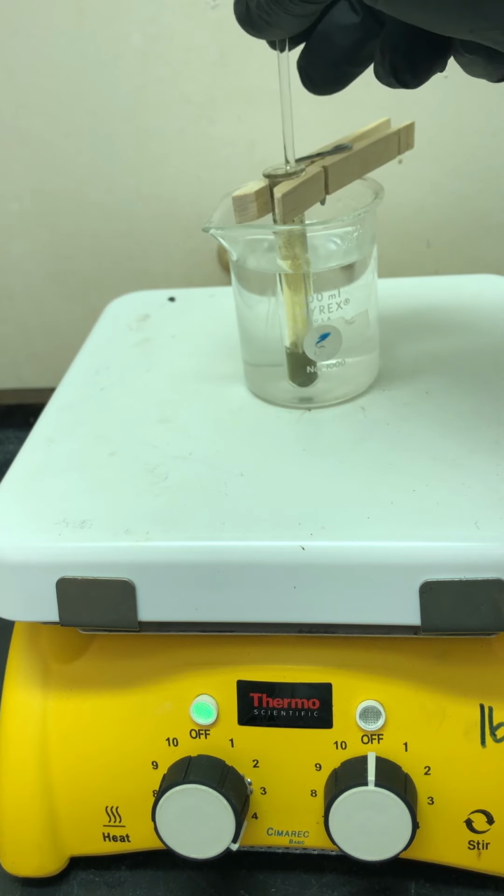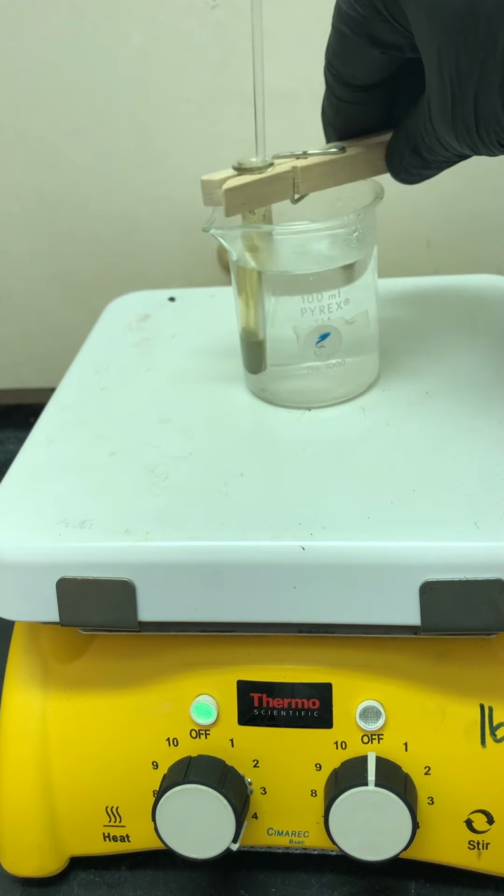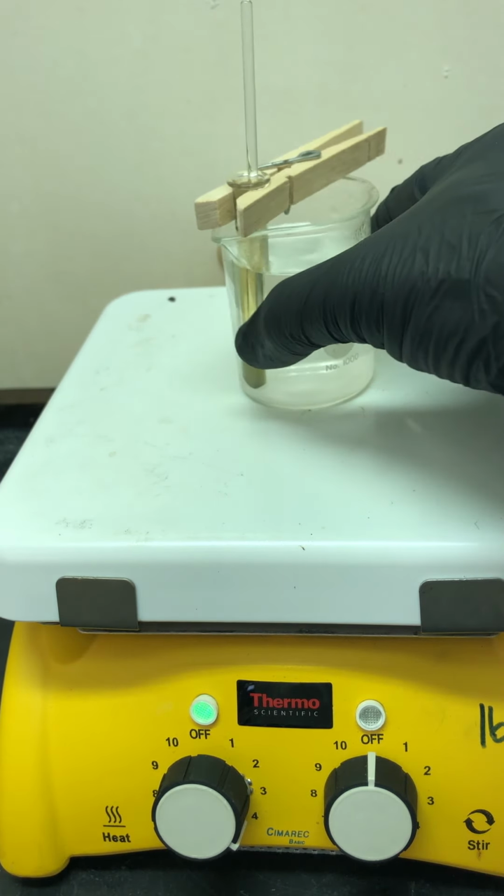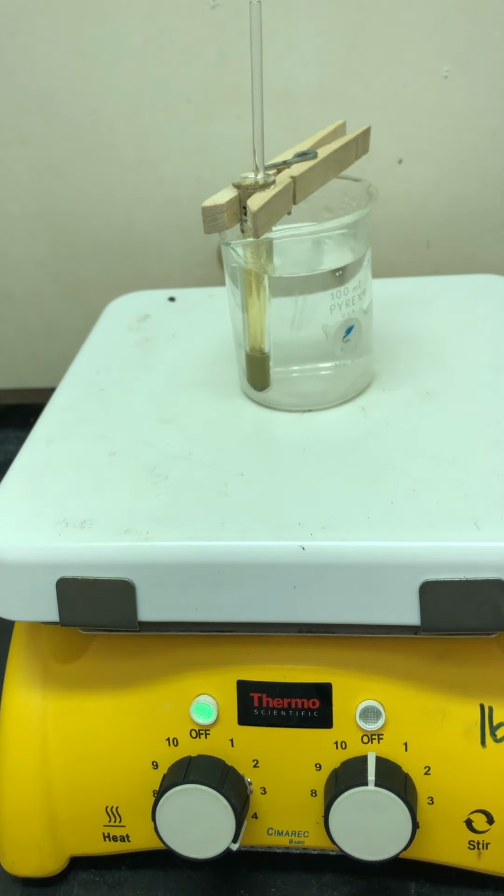When this is over, there may be some residual precipitate. Again, like I said, sulfur itself might be formed in these reactions, and so you might end up with some residual solids that we're going to remove by centrifuging our test tube. So we'll be back in 5 minutes.